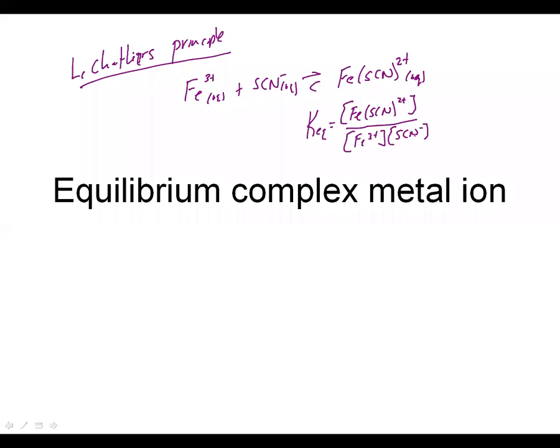And in the first part of the experiment, what you would have done in the Le Chatelier's principle part is really set up this equilibrium. And you would have made a bunch of test tubes that had this equilibrium going on. By the way, the guy on the right there is a really dark red color. On the left there, the iron 3 is kind of orangey. So it kind of goes from orange color to a really dark red if it's shifted to the right. And again, you could use that to help you determine colors and which way it would have shifted. Again, this more of a dark red, more of a kind of orangey yellow type color.